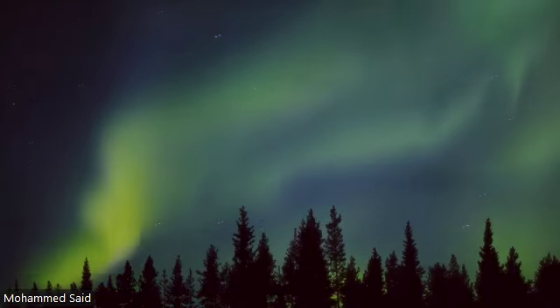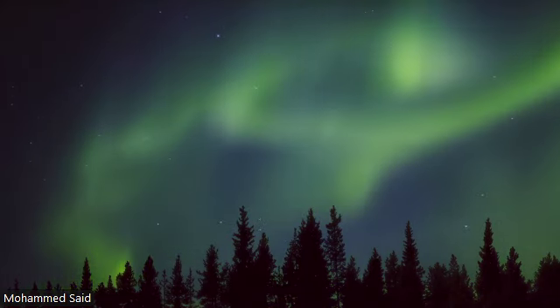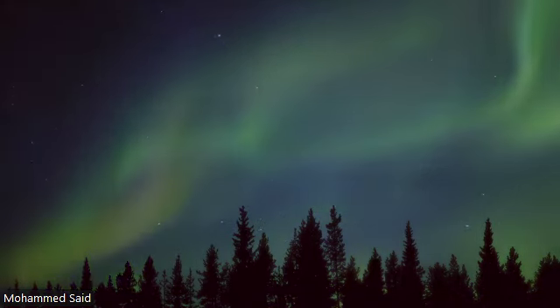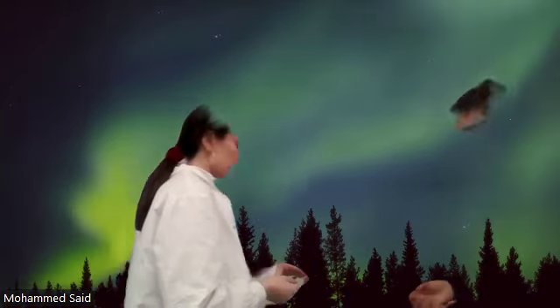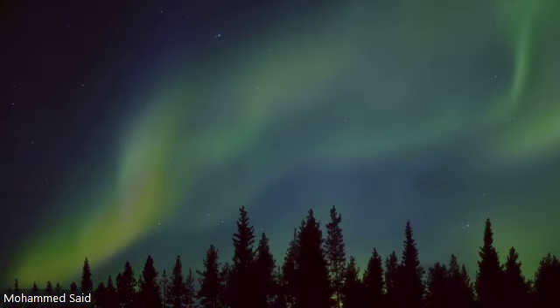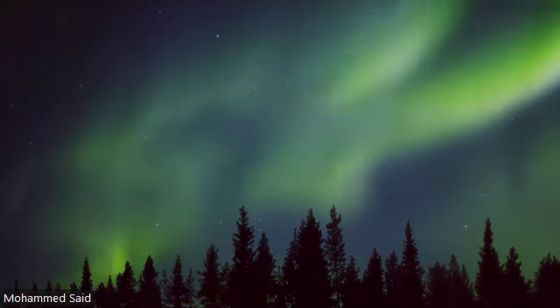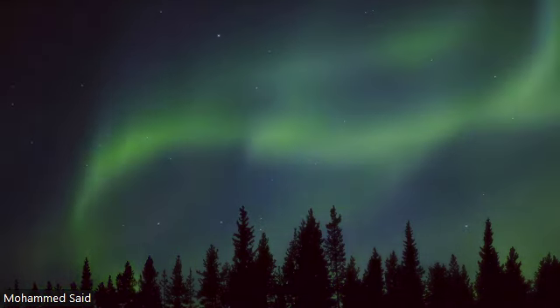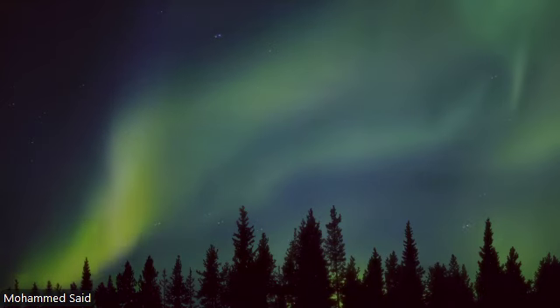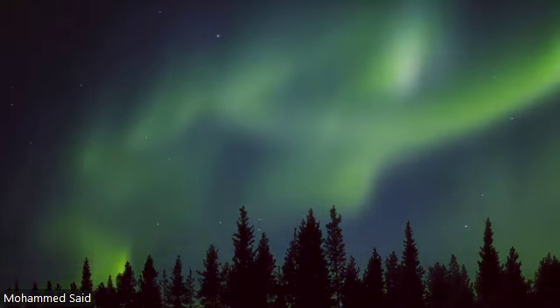Carlos, do you want a plain slide? Capsule? Yes, please. Everyone done the gram stain, to confirm, or nearly done? You can draw them in your lab notebook. You can take pictures as well. Make sure that you're able to note the shape and the color.